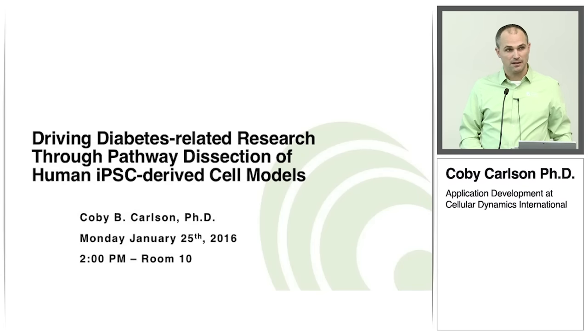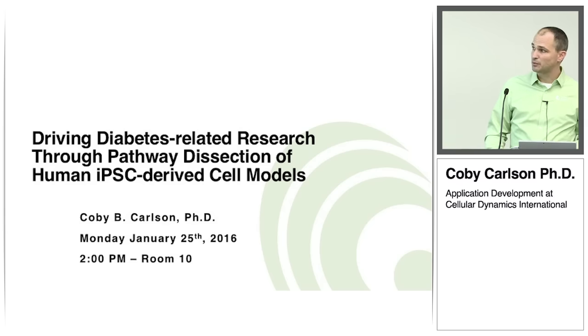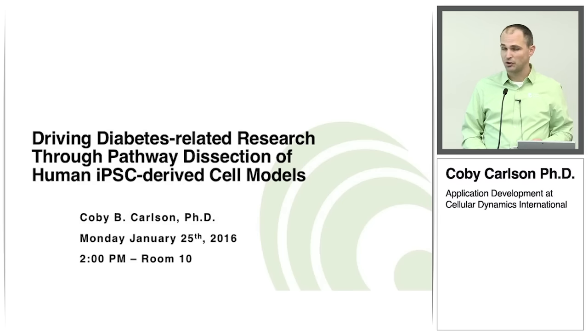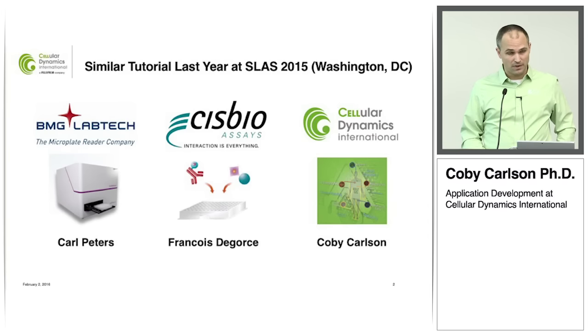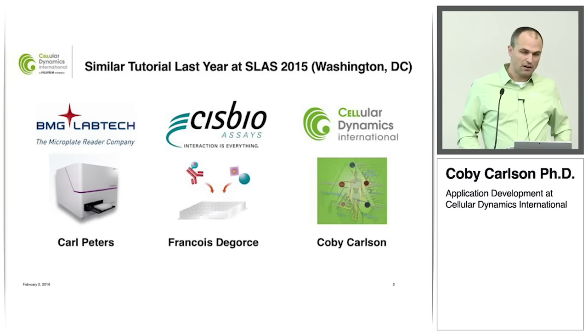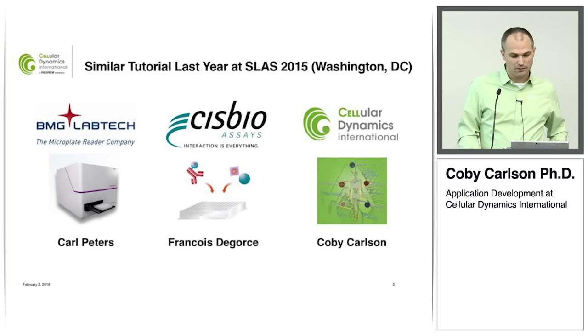I work at CDI, and I'm giving this tutorial this afternoon, titled Driving Diabetes-Related Research Through Pathway Dissection of Human iPSC-Derived Cell Models. This is actually a continuation of a presentation that we did last year at SLAS in Washington, D.C., highlighting a three-way collaboration between BMG Labtech, Cisbio, and CDI that has been really fun to continue working on.